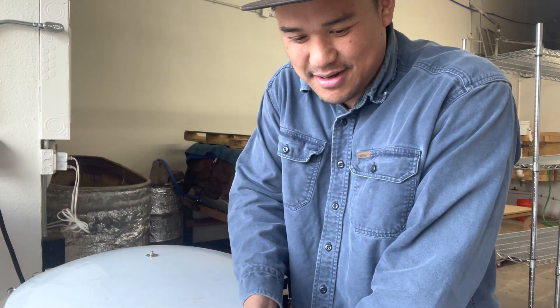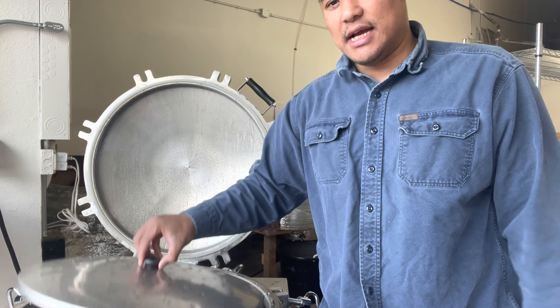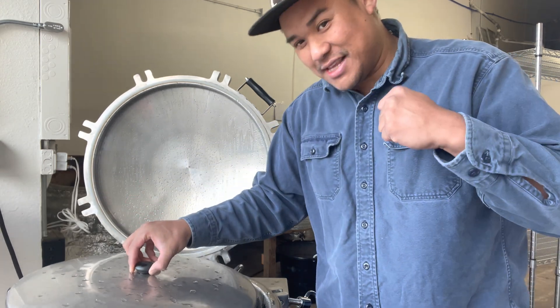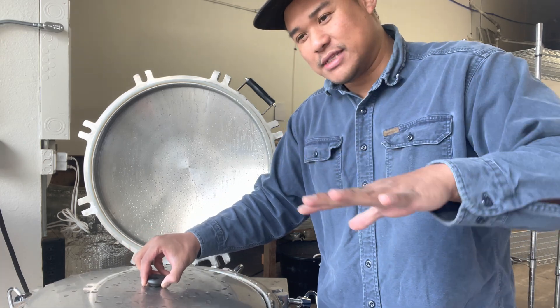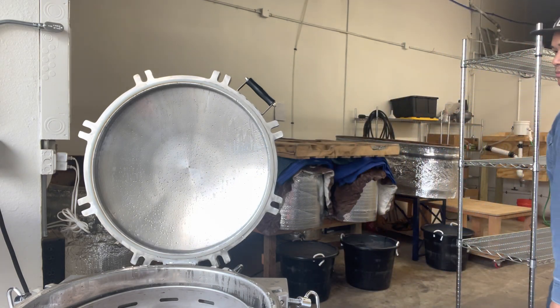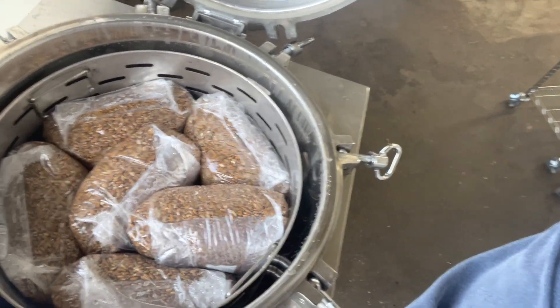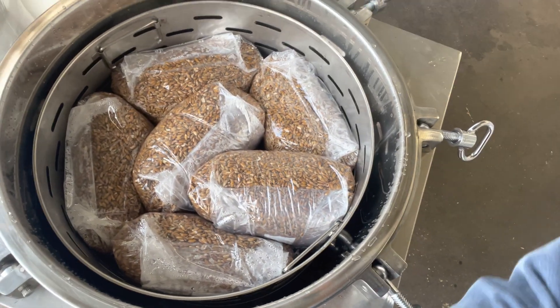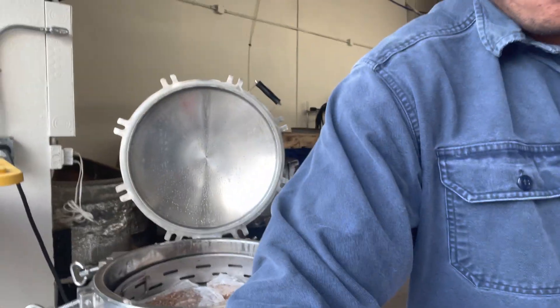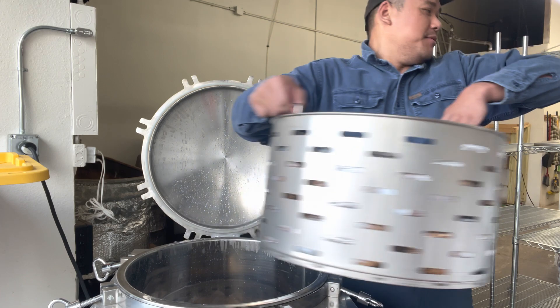It comes with an anti-scald lid, which is really convenient because sometimes if you lift it while it's hot, steam is going to blow up - but it'll stay out of your face because of this. I have it full of grain right now that I just ran. Inside, as you can see, there are two baskets. It's a little heavy but I'll lift one up for you.